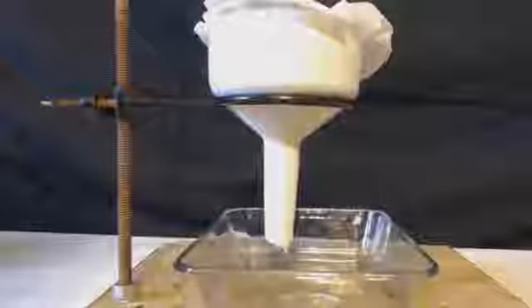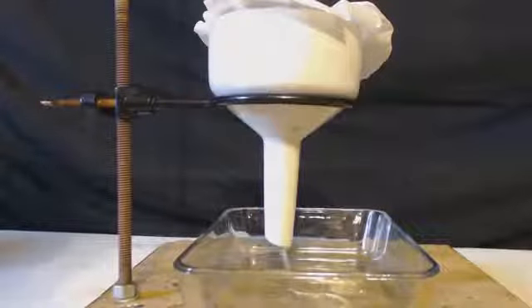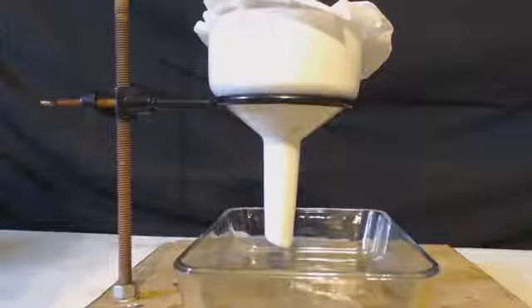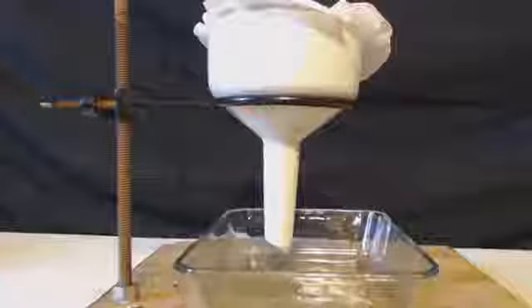I'm putting it in a shallow, bigger pan than the other one because I'm not going to use any heat, so this is going to take forever to evaporate totally naturally. So I give it more surface area this way. Well, there you can see it's crystal clear water. You can see that film on there. Yeah, it's white. So that's what didn't react.